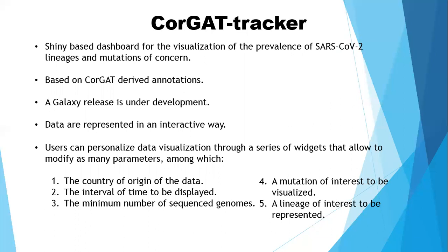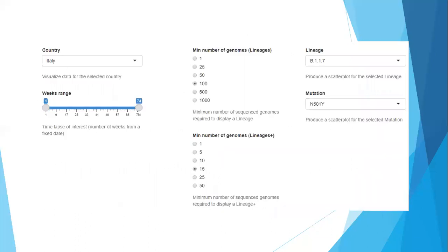All the parameters that can be personalized are listed at the bottom of the slide, and here you have an overview of all the widgets available to personalize data visualization.